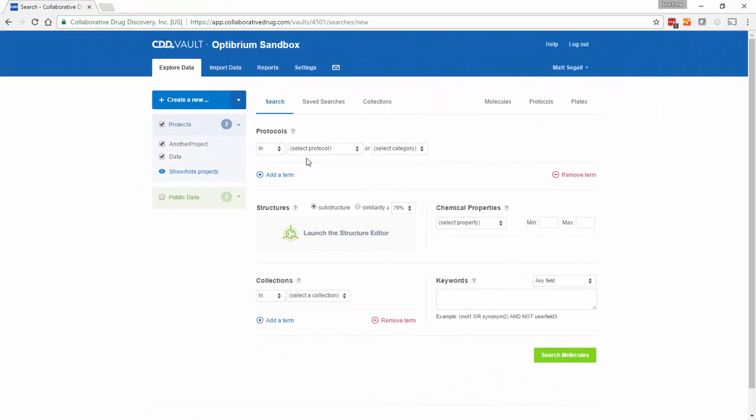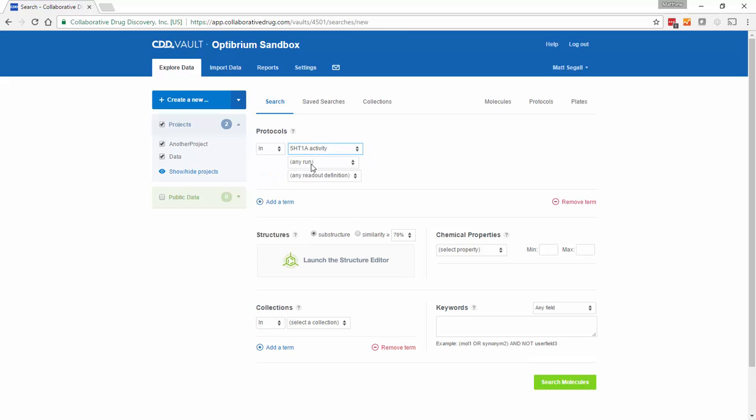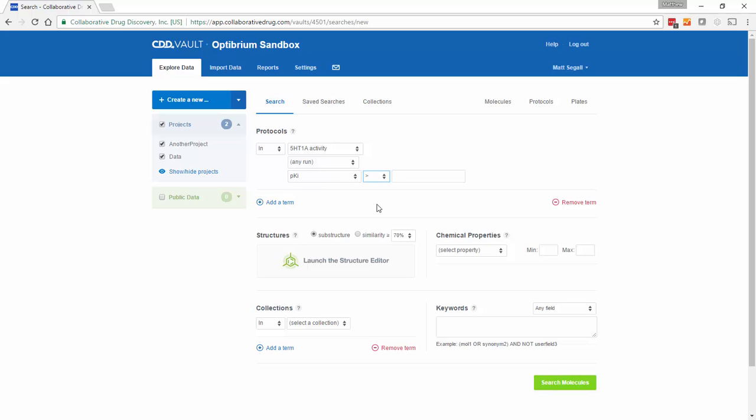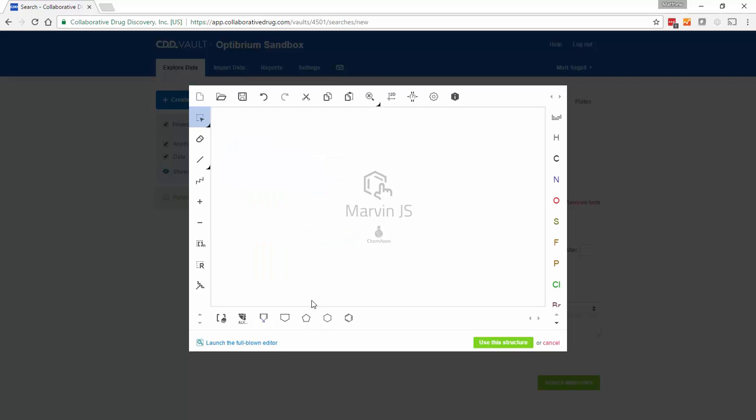You can create a new search within CDD Vault. In this case, we will search for compounds with a pKi of greater than 5 in a screen against 5HT1A, that's better than 10 micromolar, from a series containing a piperidine moiety.